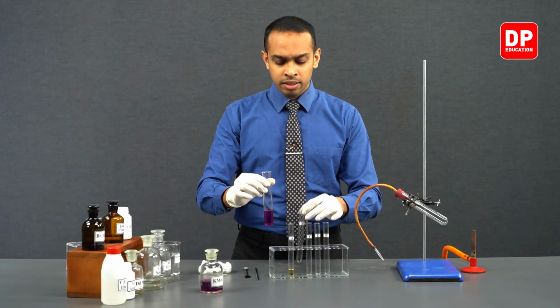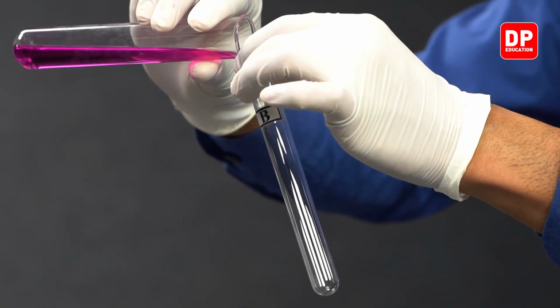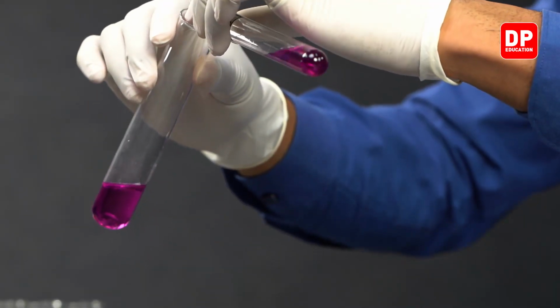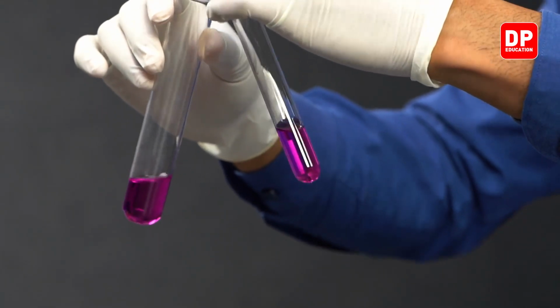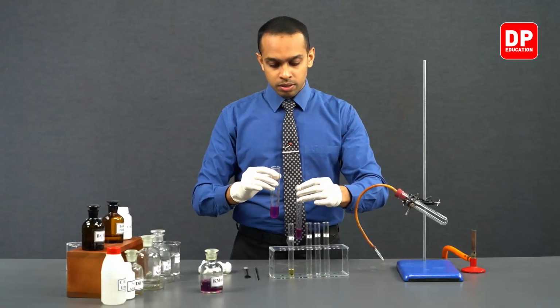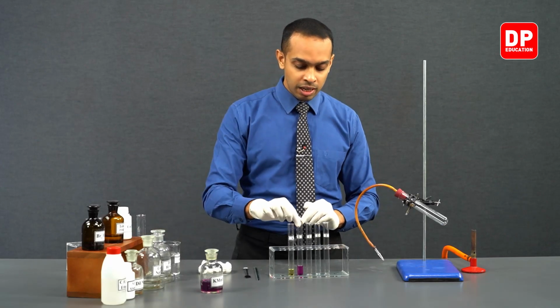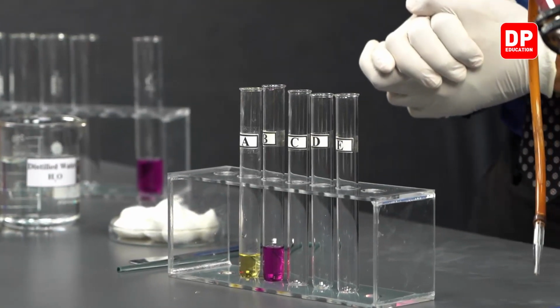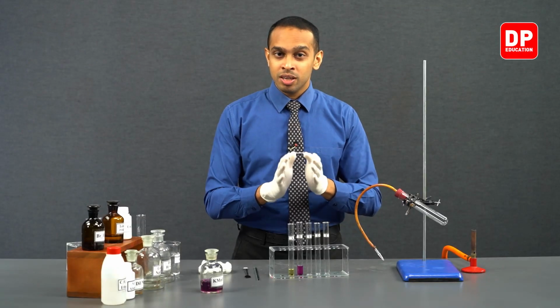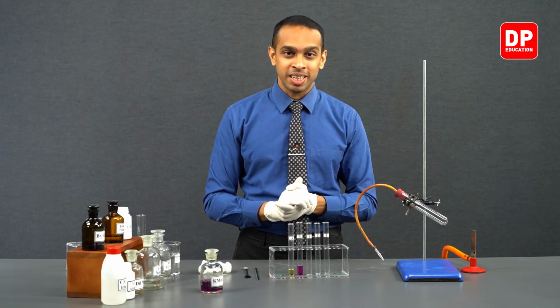So let's take a small amount of this cold dilute and alkaline potassium permanganate solution into a test tube. And this test tube that we have here is labeled B. So in the test tube that is labeled B, we have our dilute alkaline potassium permanganate solution.